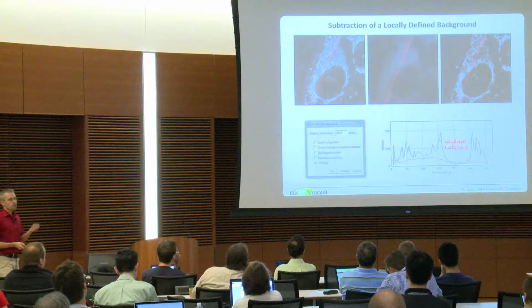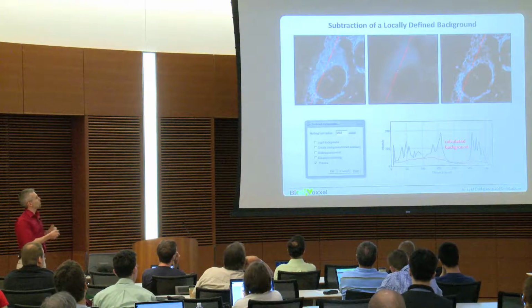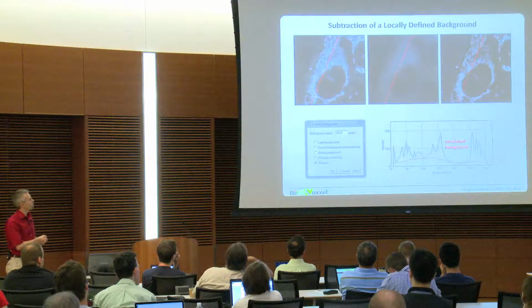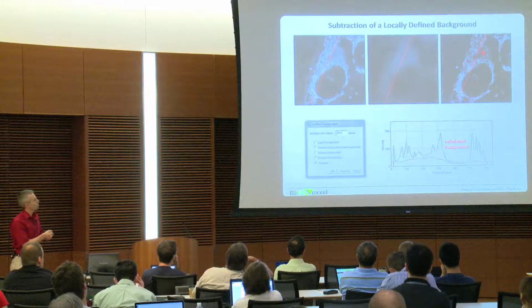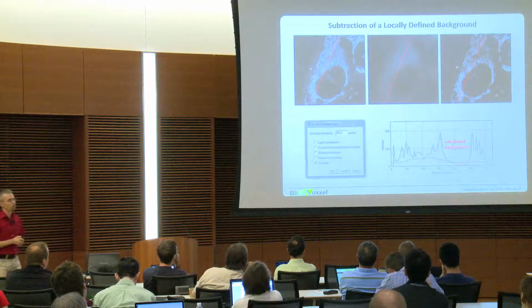So this is one example of how the normal subtract background method does that. It creates a background here. Again, also in this line plot, as you see down here, it creates a background from the information which comes from the image, and then subtracts this. And you see that actually outside it subtracts less than inside because of the different intensities you have here.